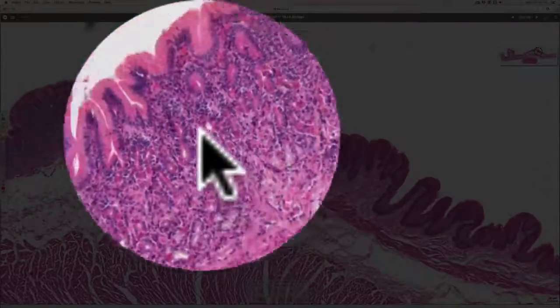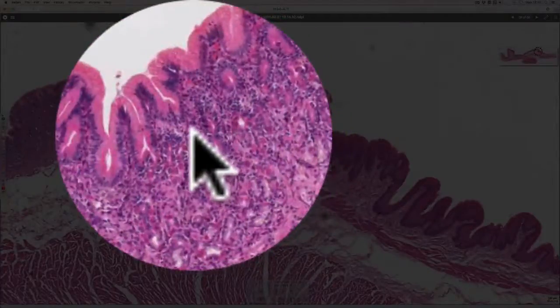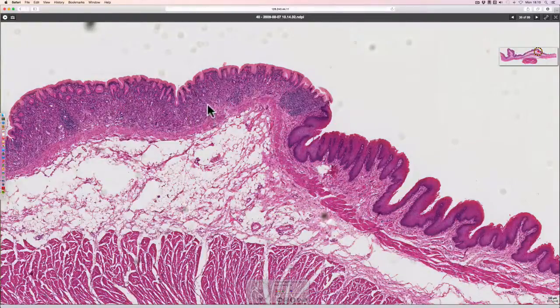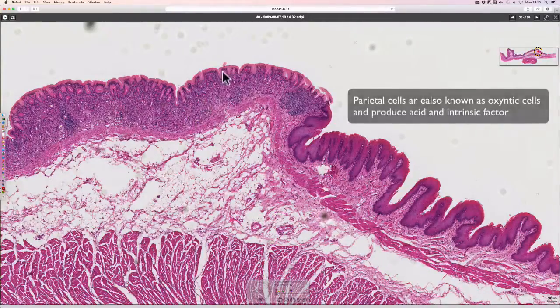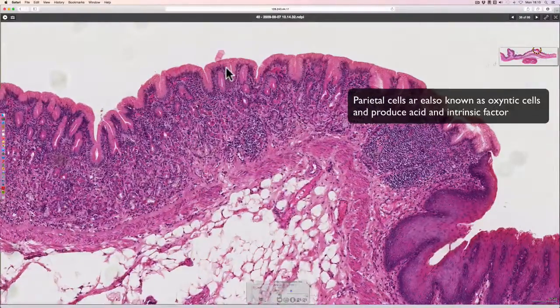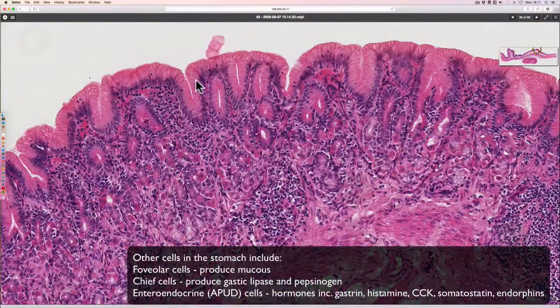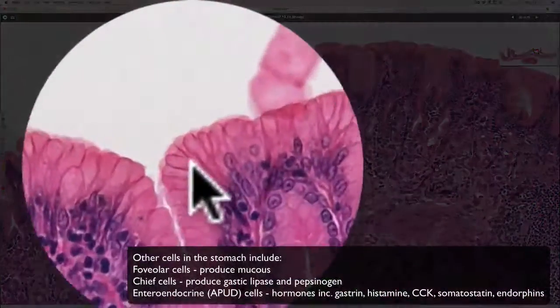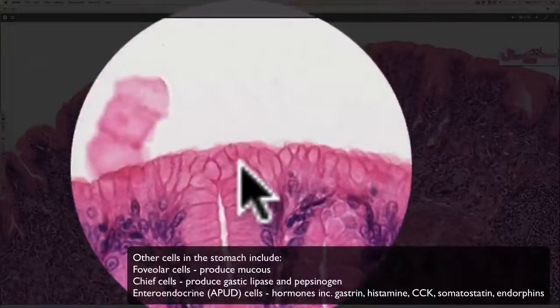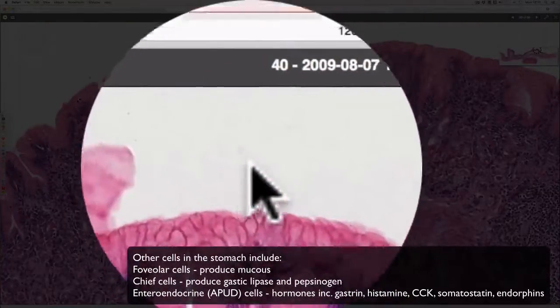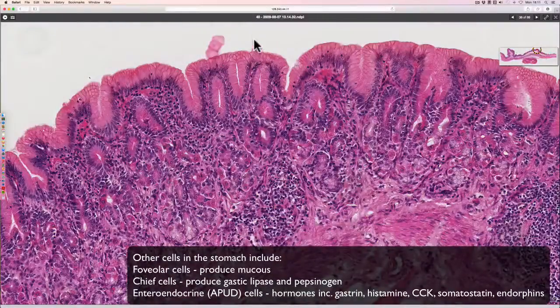Within these glands you will find the parietal cells, also called oxyntic cells, and chief cells of the stomach that produce stomach components like acid and pepsinogen. The surface mucus cells at the top have nuclei at the base, and the top of them is filled with pale pink-staining mucus. This mucus is secreted to form a thick protective layer over the stomach mucosa, protecting it from the very acidic contents of the stomach.